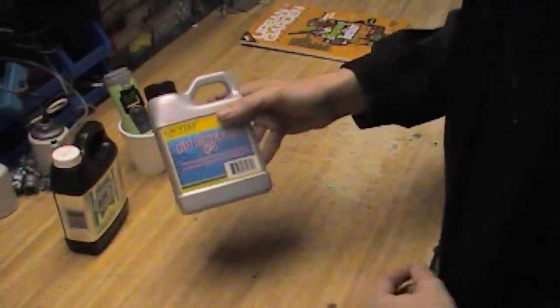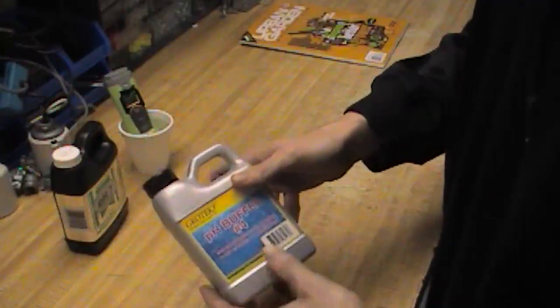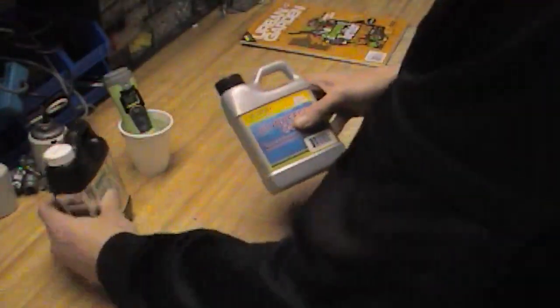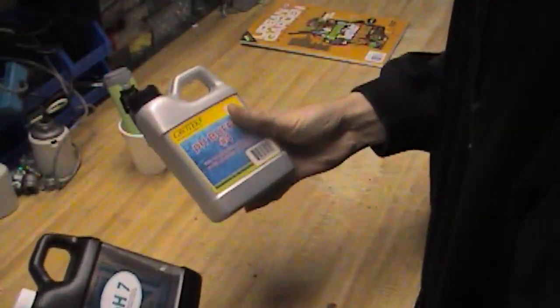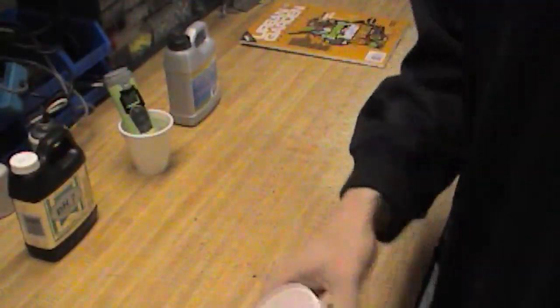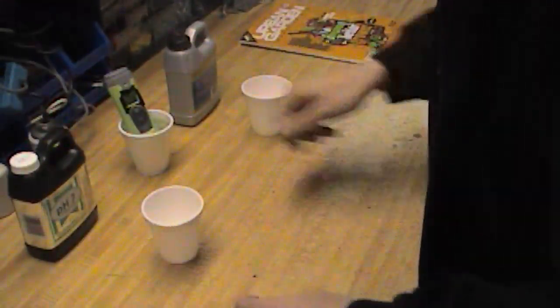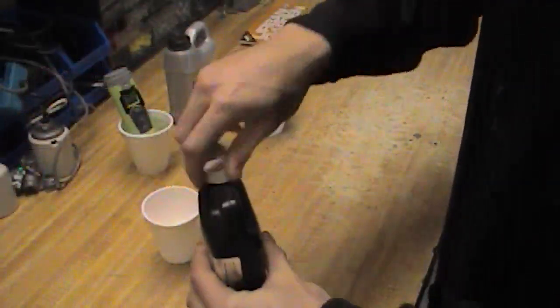I've got here pH 7 and pH buffer 4. These are the calibration solutions, buffered at pH 7 and pH 4. I got a couple styrofoam cups here, I'm just going to put a little bit into each one.